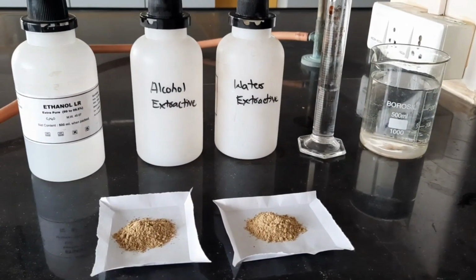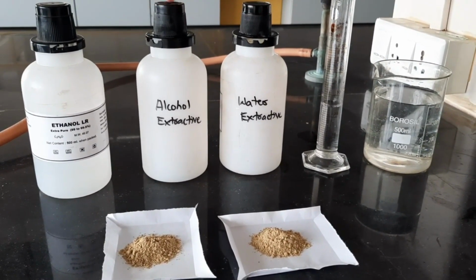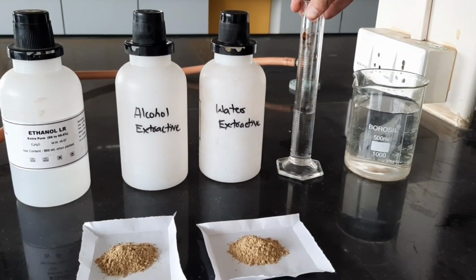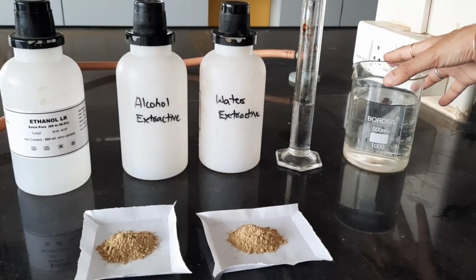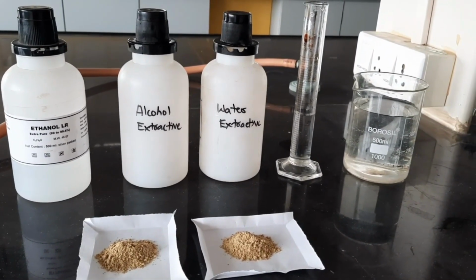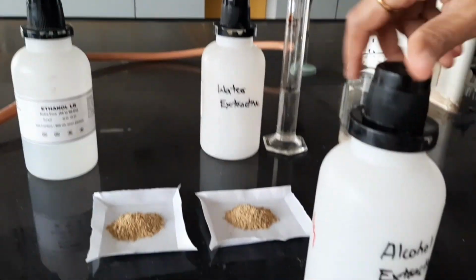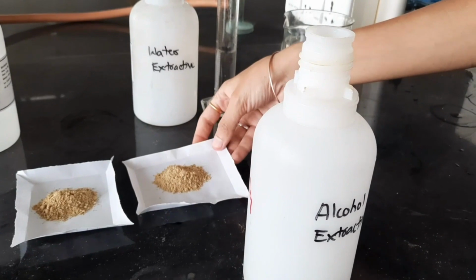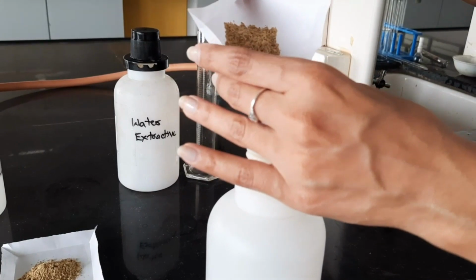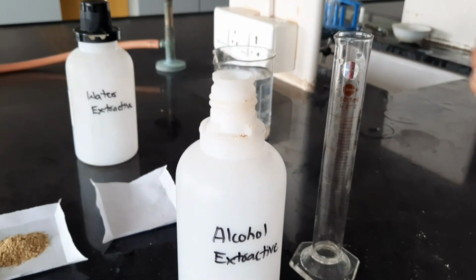So here are the requirements which we will require for extractive value, that is ethanol, 2 empty bottles, one for alcohol extractive, other for water extractive, measuring cylinder to measure the volume, and water. Now we have weighed already the 3 grams of our crude drug. So we will start performing the practical, that we will place this 3 gram of our sample into alcohol extractive bottle. To this we will add 100 ml of ethanol.